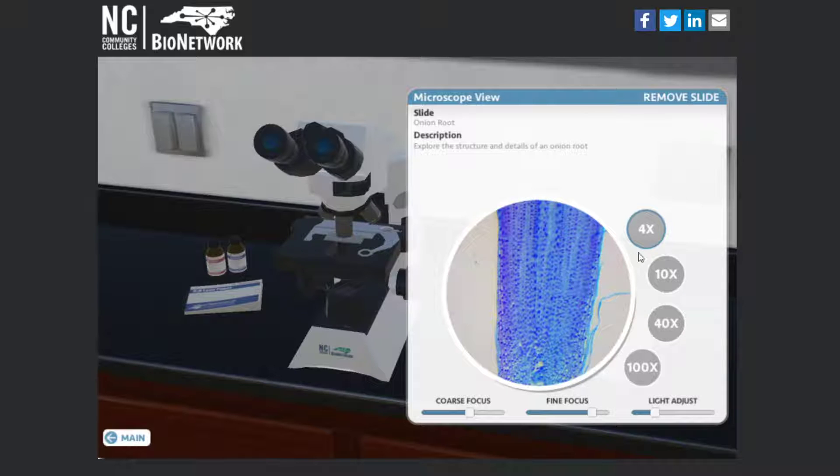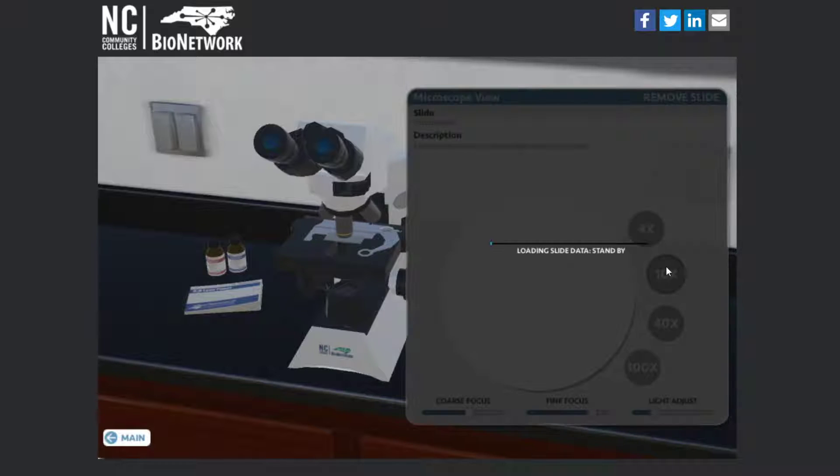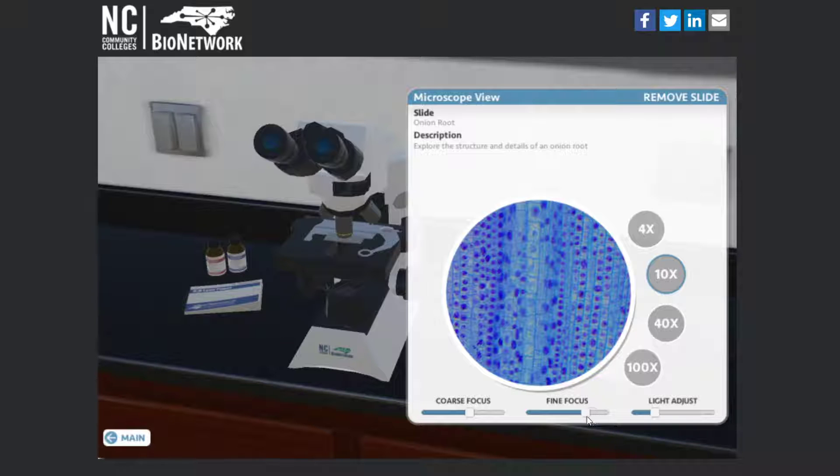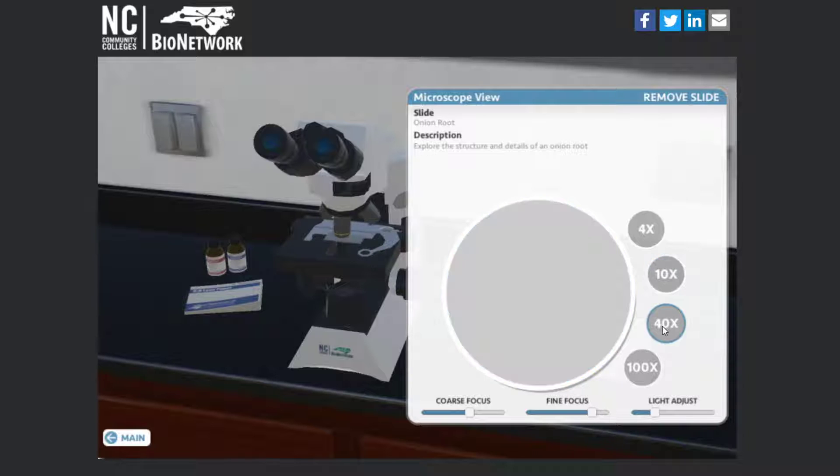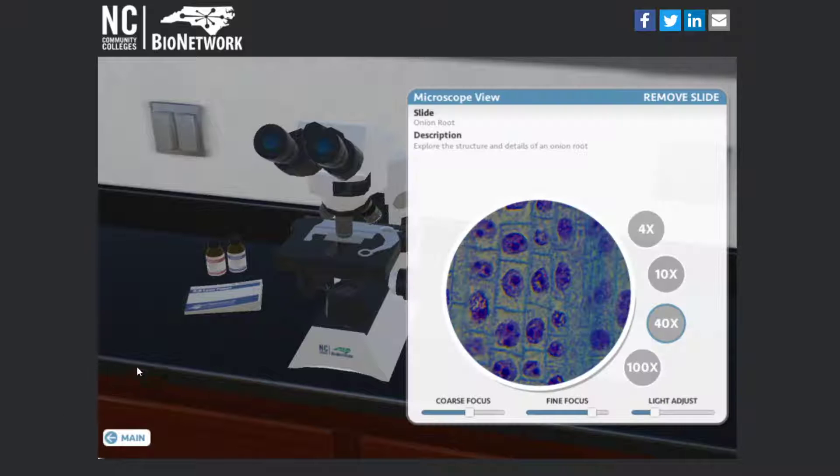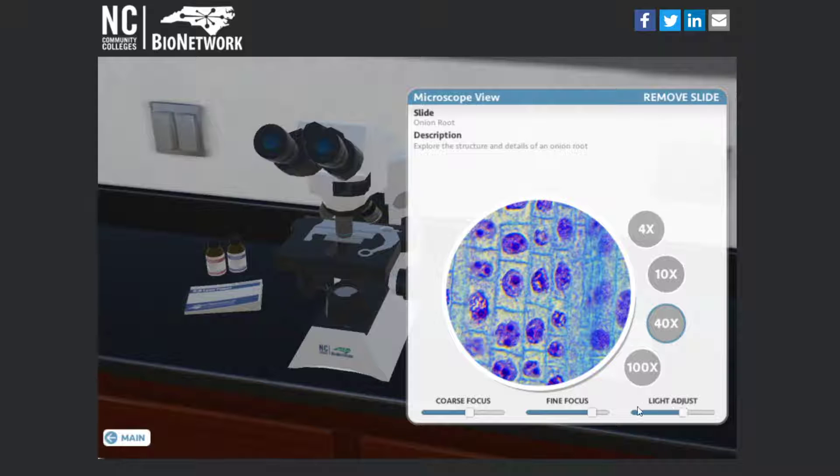If you want to take a closer look, you just go up through the objectives. Again, you might have to mess with the fine focus a little bit to get it exactly how you want. You can also adjust the amount of light that's coming through.